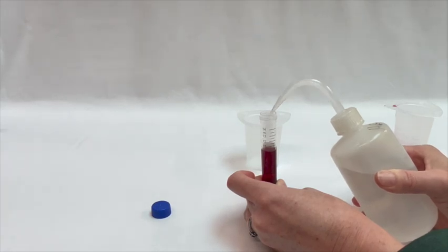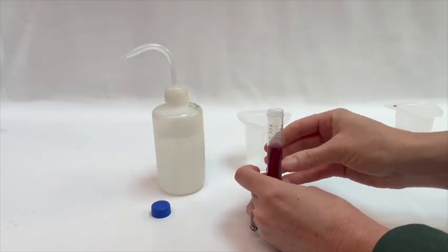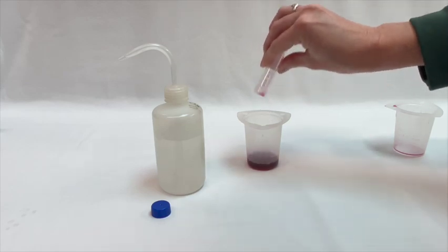You can then pour your sample back into the beaker if you want, or simply cap the conical tube and leave it in the conical tube. This is totally up to you. Here, I will pour the sample back into the beaker.